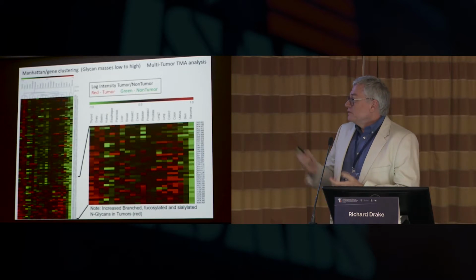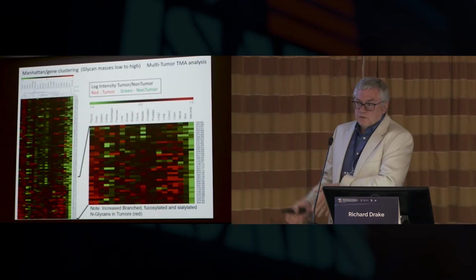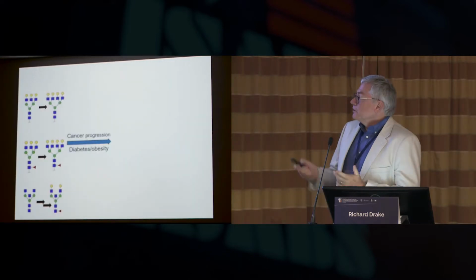And so we've looked at 20, and almost every single organ's different. It's at every level, whether even just the normal or within the tumor. So at best, we've covered 20% of the targets, if that's probably being liberal. There's a lot of things to look at in the human glycome as far as mapping this out. But we already knew that.